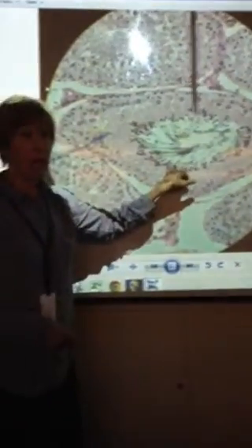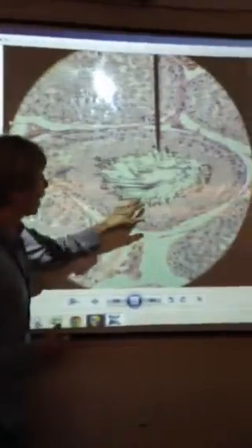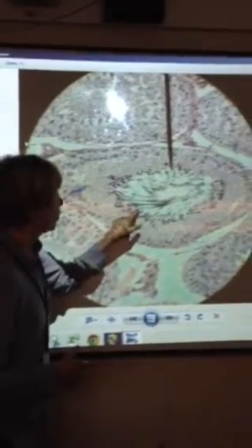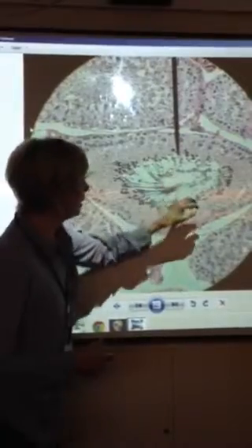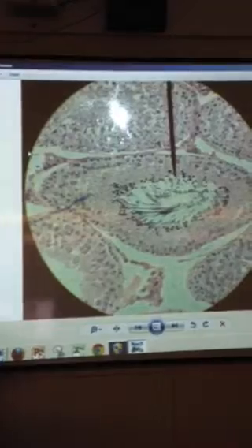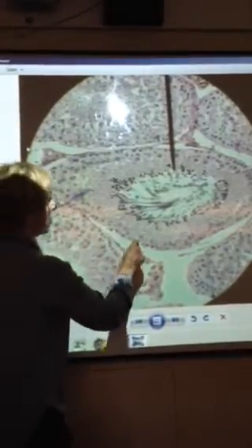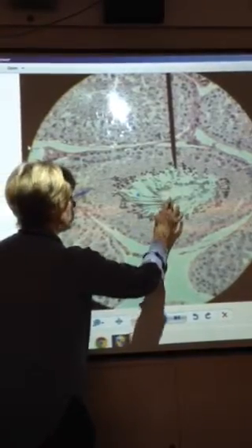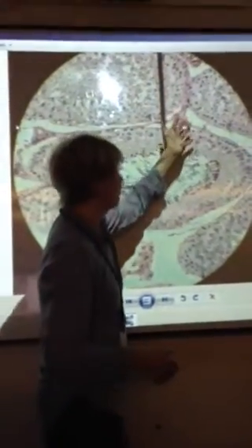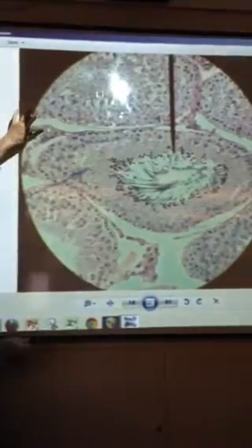And again, these are not from humans, so the sperm heads are very thin, sickle-shaped, and these are the flagella. So spermatids out here, the sperm with the flagella, and this doesn't show the sperm heads too well, and that's usually a hard one for me to ask. So this is the seminiferous tubule, spermatogonia, spermatids, sperm, flagella, and what you find between these are blood vessels, connective tissue, etc. But there's a little artery right there.